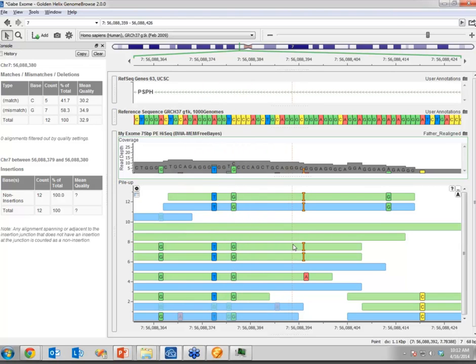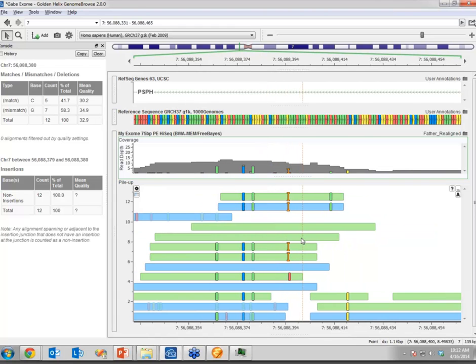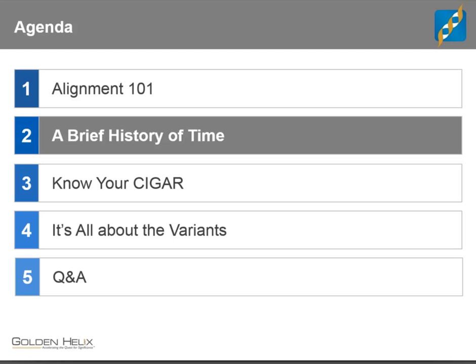Now, just mismatches themselves aren't too hard to handle, but there are legitimate reasons why you have what we call gaps, either gaps between the sequence that was read from my DNA and the reference, or between the reference and the sequence. And if it's the first one, we have an insertion. If it's the second one, there'd be a deletion in the sequence itself. And so we can draw those and hover over those and see them in Browse, but an algorithm has to figure out how to take hundreds of millions of these reads and place them on the human reference of 3.1 billion length string, essentially, and do that efficiently so you're not waiting weeks. And that's what we're going to cover next.